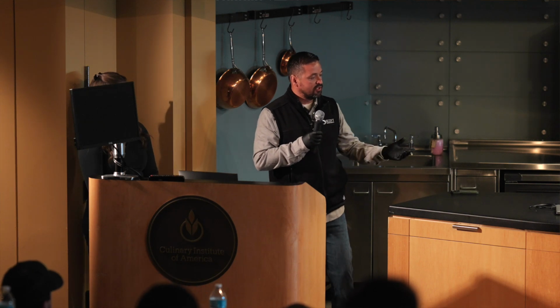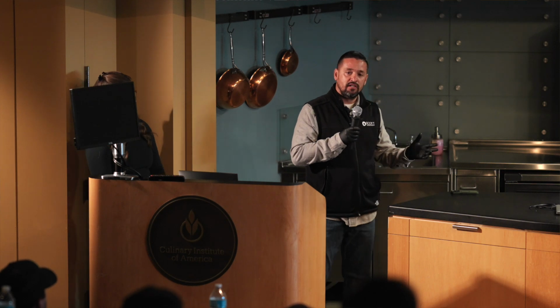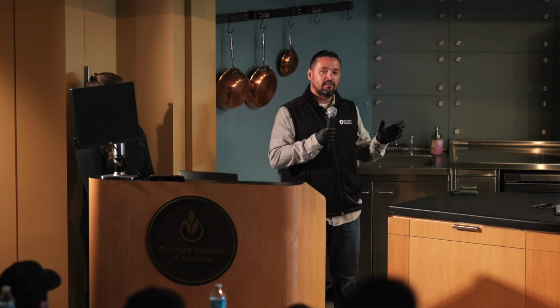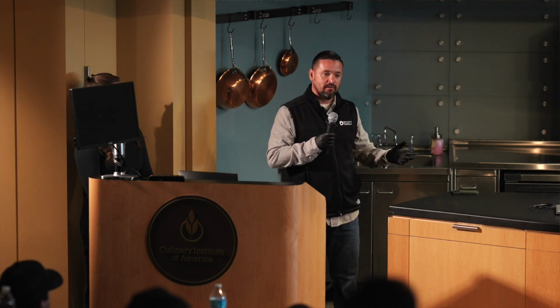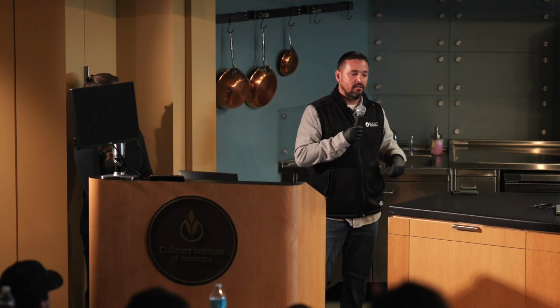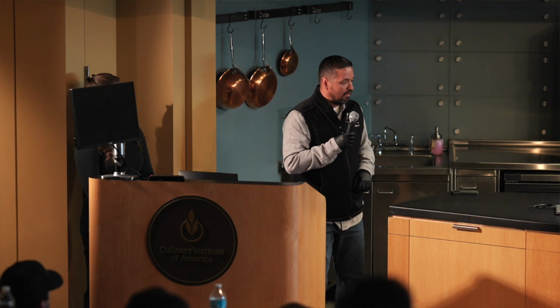So yeah, talking about filterability, Ella did a great job talking about filterability. I am going to do a demonstration. Now, I did set the unit up earlier, so I'm going to kind of go back on a couple things. We recommend testing the wine at the same temperature, things like that. Unfortunately, I just wanted to be ready, so I already got the wine loaded into the chamber, and I already put the filter disc inside the chamber as well.